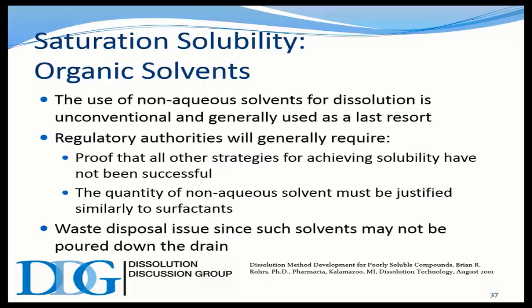So just a word on organic solvents here. I mentioned volume, we mentioned surfactants, but organic solvents, again, are generally unconventional and used as a last resort. However, this has not prohibited their use. Proof above all other strategies failing has to be provided. So what we call this is more of a trail of tears approach. You have to exhaust yourself on all the volume and surfactant and media, even how we handle the API.